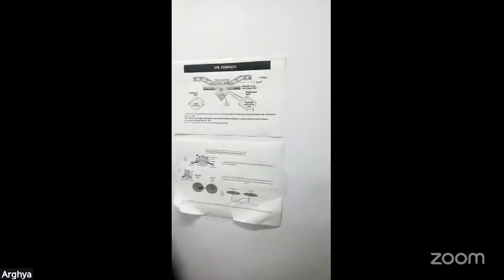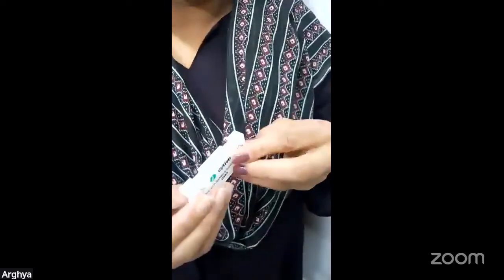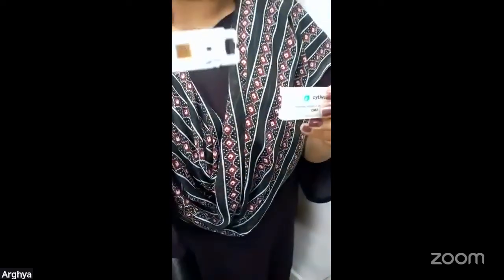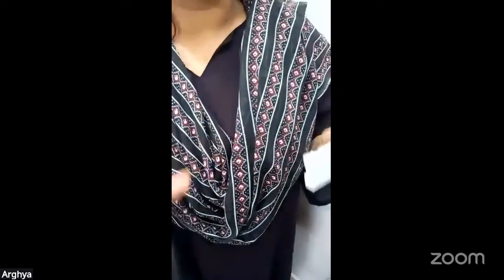What happens is we immobilize one of the interacting partners and we flow the other partner. And as the binding occurs, we see changes. What kind of changes do we see? For example, this is the principle. We immobilize one of the interacting partners on the chip. These are the chips. The chip has a gold surface, and we immobilize the interacting partner using different chemistries.